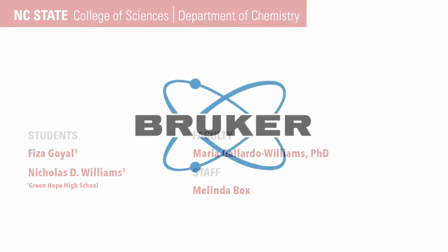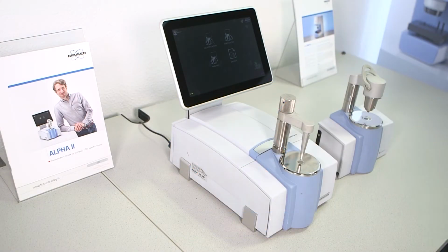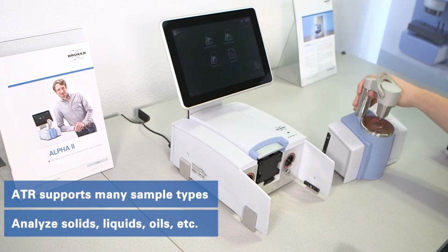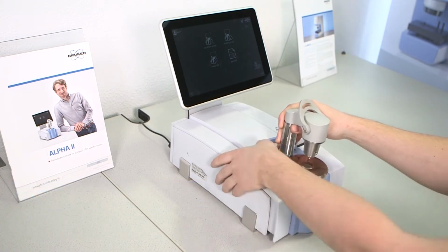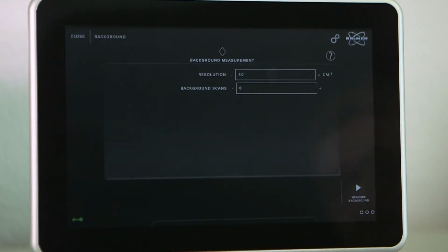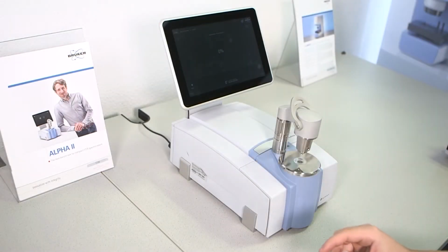This video is about the reliable verification of known materials. ATR is suitable for a wide range of sample types. For an easier handling of liquid samples, we now use an ATR unit with a sample trough. The start of any FTIR analysis is a background measurement. Before, make sure the crystal is clean and use rubbing alcohol and soft tissues if cleaning is necessary.